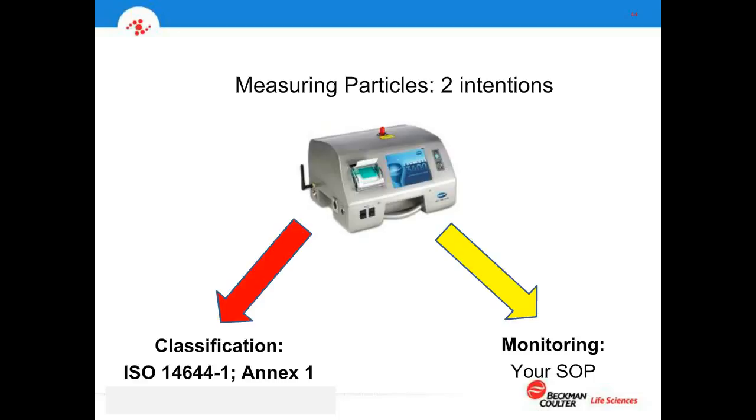And so, again, just realize that you don't want to take classification methodology for a minimum number of points, for example, and apply it to monitoring. In most cases, monitoring involves really 1 or 2 critical points in an area or a zone, not 6 or 9. Just depends on the type of operation. So again, monitoring is a way to understand that your control of risk in your operation is appropriate, that you have enough information to say, I've tried to control my risk as well as possible regarding any particular contamination from particles or any effect in my process due to airborne particles.